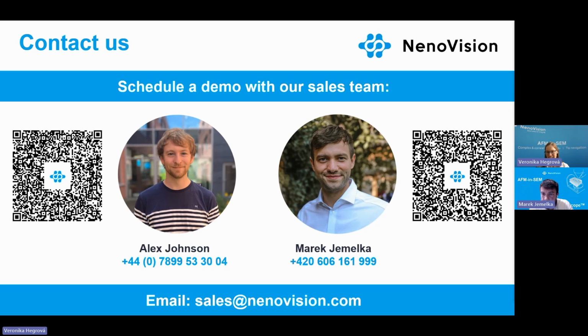There is a question from Javier. Are there any specific settings or setup for the MFM analysis other than the tips? You're correct that the tips are the most important part, we need to have the magnetic wire on top at the end. And we are using a 2-pass technique. Basically, different from the conductive AFM, we're not going once on each line, but we're going twice per line.